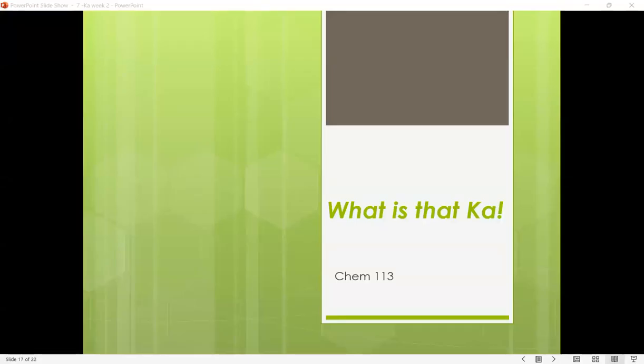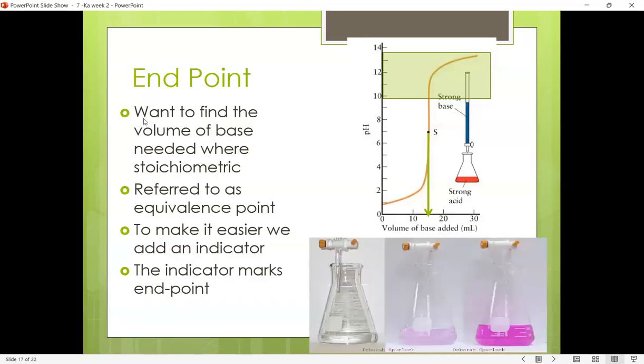All right. So here we are back to Excel. And so this week, what you're going to do is find Ka, but not one single Ka. You're going to find it for multiple points. All right. So first, just remember last time you collected pH data along the titration.